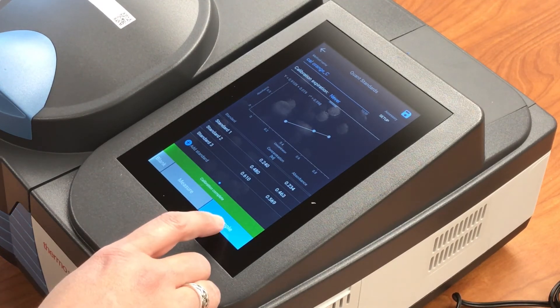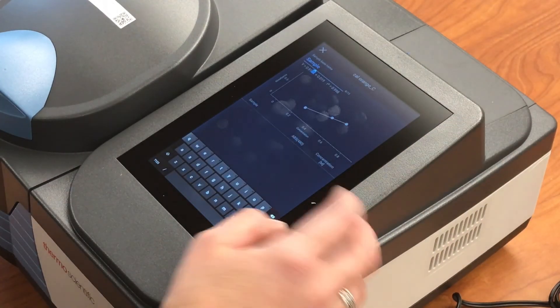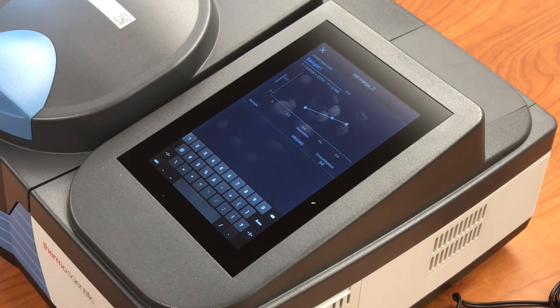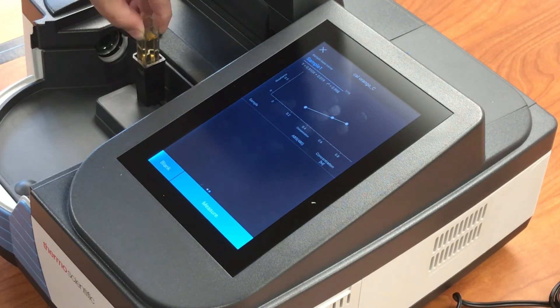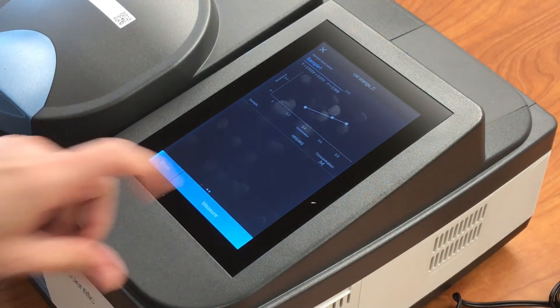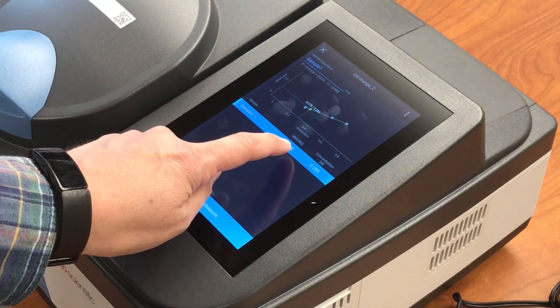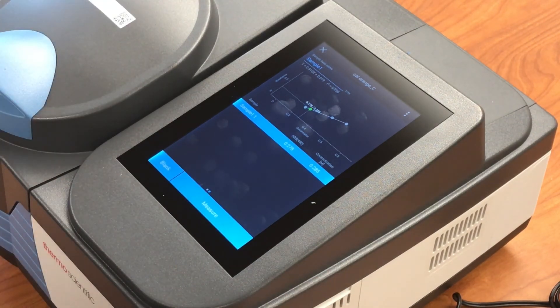Next, we can measure the absorbance of the sample. So we'll click sample, and we can input the sample name — we could just say sample one, for instance. Then we can put the sample in the instrument and measure the absorbance of that sample. Now I can put my sample with an unknown concentration in the spectrometer and touch measure. It will give me the absorbance at 480 nanometers, which is where we built our calibration curve. And because we've already measured the standards and the instrument knows their concentrations, it actually outputs the concentration for us.